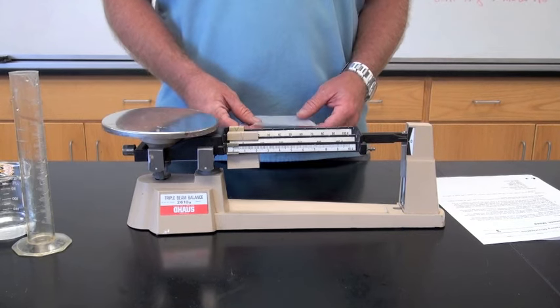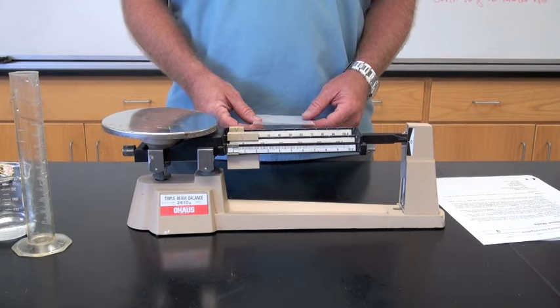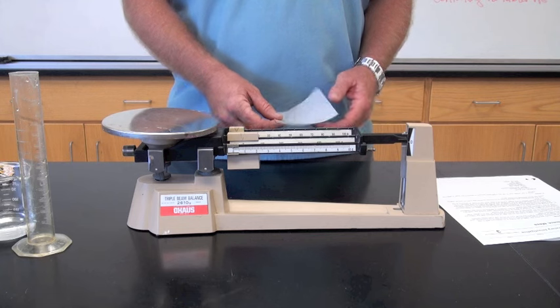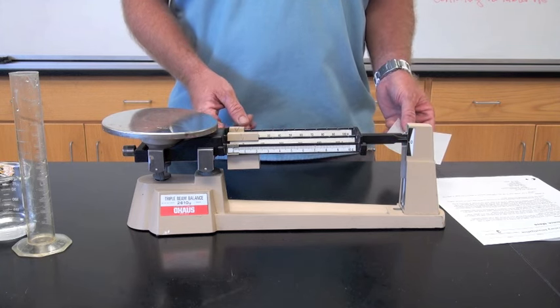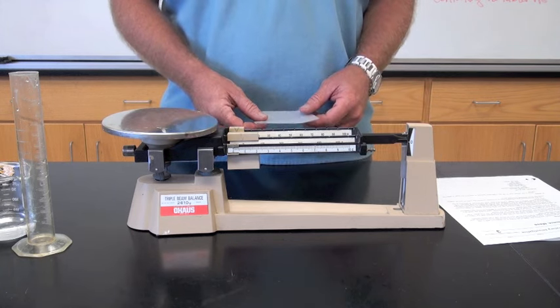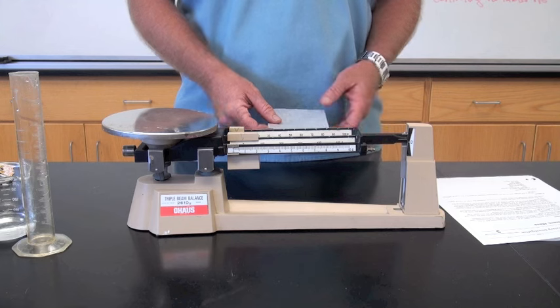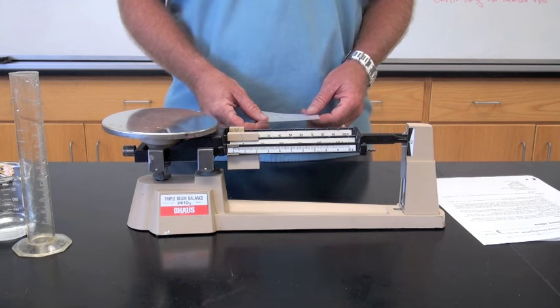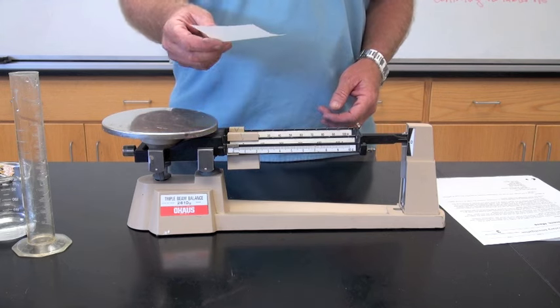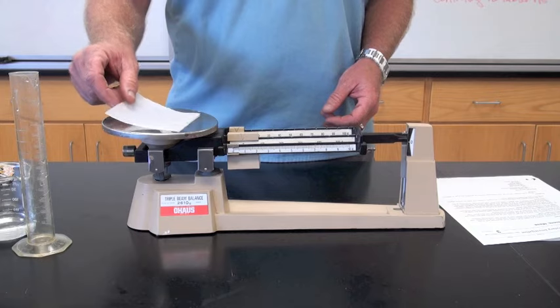The third way you can use a triple beam balance is to measure out a certain amount of a substance. It is necessary to use this procedure to obtain the exact amount of a solid chemical substance. Chemicals should never be placed directly on the balance pan, so it's necessary to first find the mass of weighing paper or container. Here's my weighing paper.